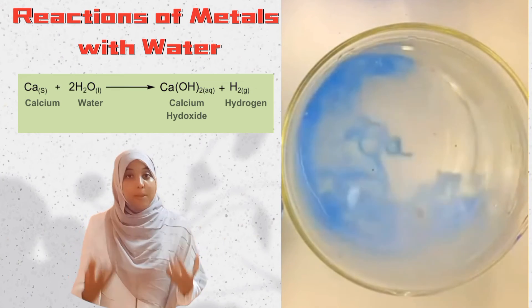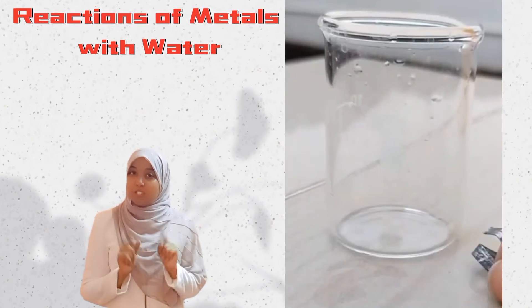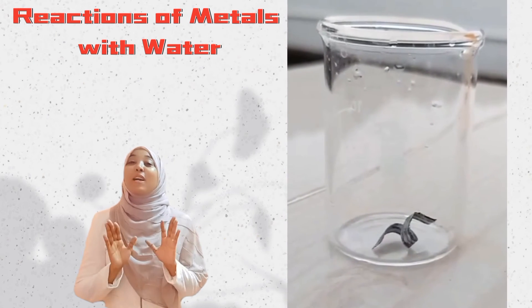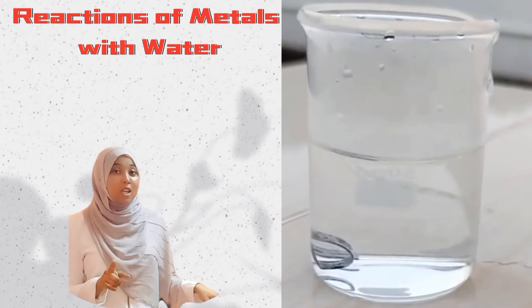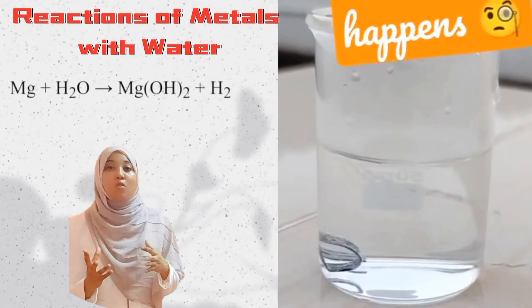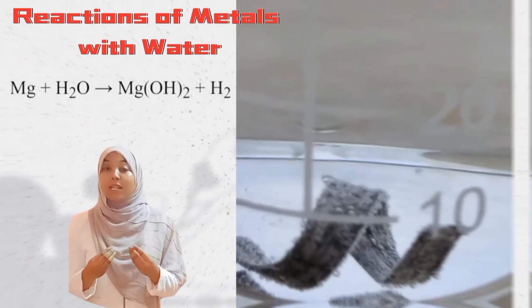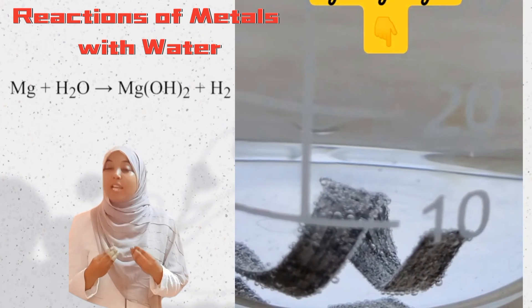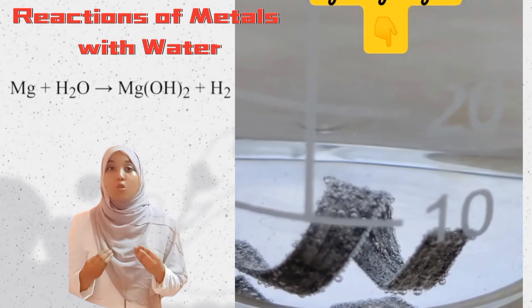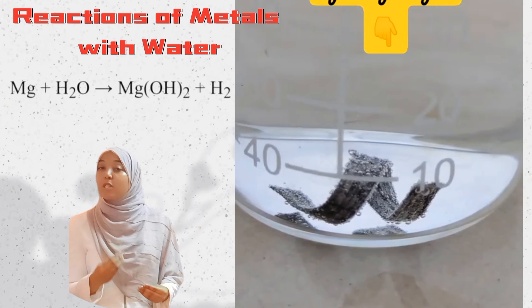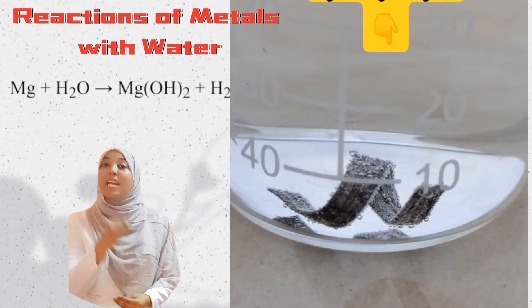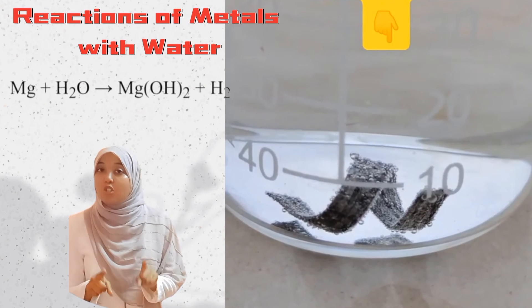Moving on to magnesium. Magnesium is less reactive than calcium. You can clearly see the fizzing bubbles being produced, which is hydrogen gas. But the reaction is slow, especially with cold water at room temperature. Magnesium reacts, leading to the formation of magnesium hydroxide and hydrogen gas, but the reaction is slower compared to calcium.